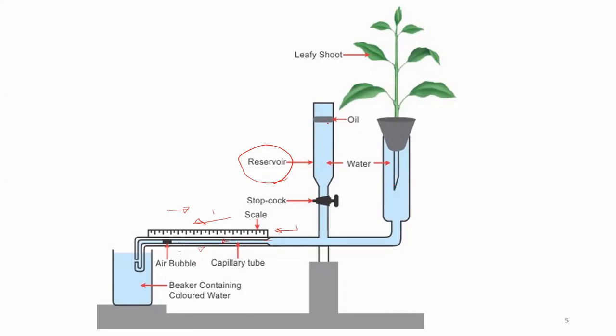Then in here, we want to analyze the transpiration through the stomata, no? Yes, but there are some other possibilities. The water will evaporate, isn't it? This is an open setup now, so the water can also evaporate through this area and this area.